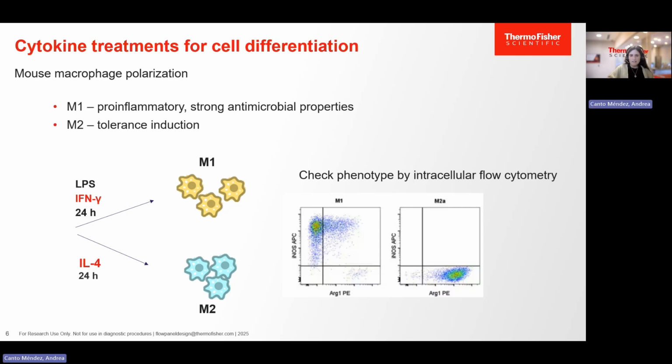We will go into details about how to perform intracellular flow in one of the upcoming talks of the series. But for now, we just wanted to illustrate how flow cytometry is essential in this type of protocol to ensure everything works properly with our recombinant proteins.